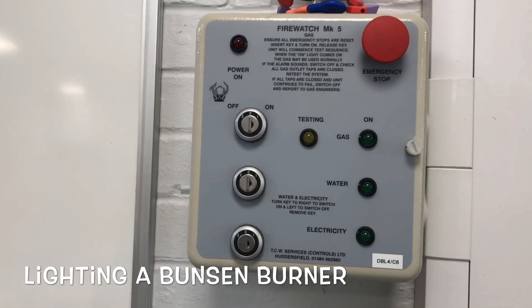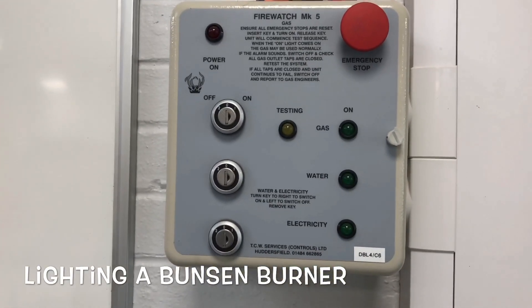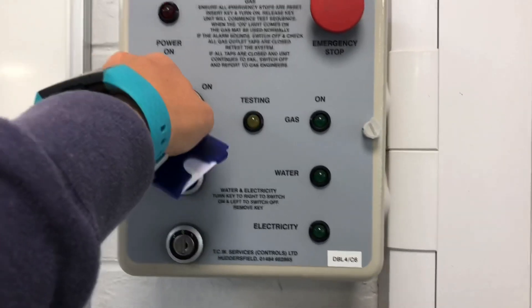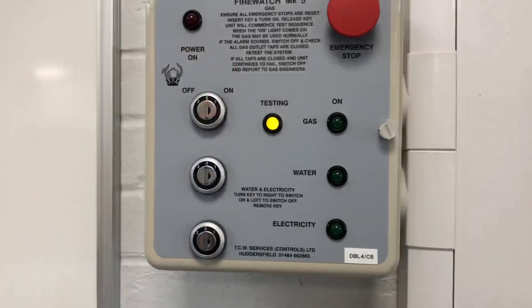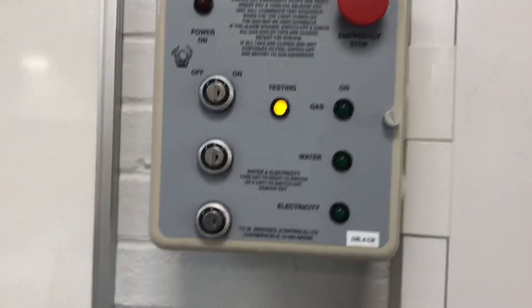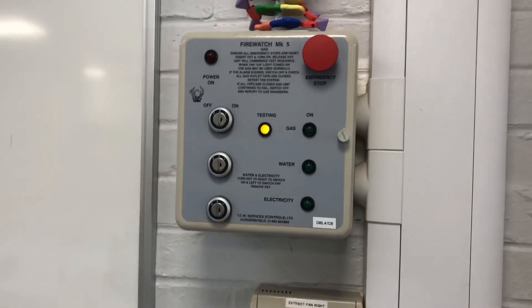In this video we're going to look at lighting a Bunsen burner. The first thing I do is come over to this control box and flick the switch for the gas to come on. You can see we've got this testing light — this is testing all the pipes to make sure that there are no issues with the gas coming through.